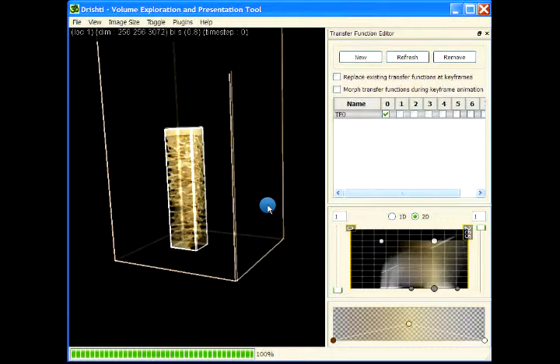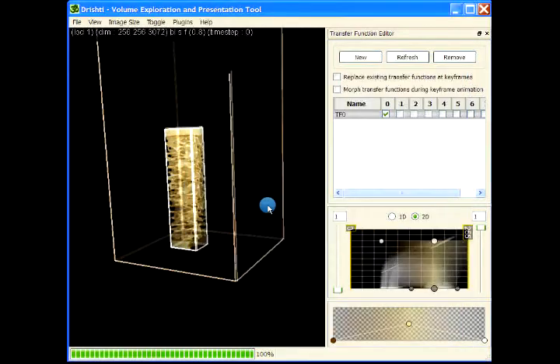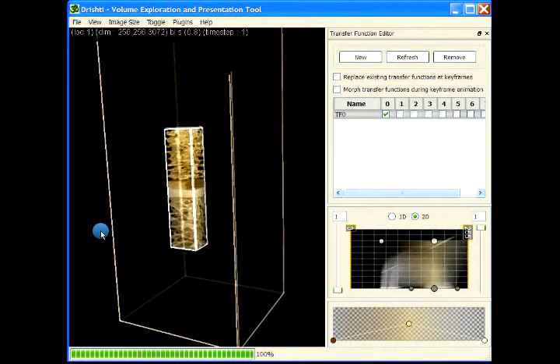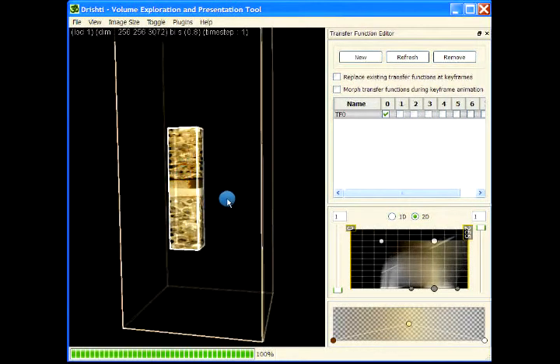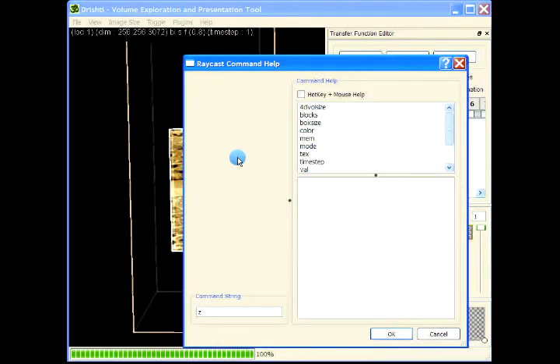And similarly you can do it for Z. So Z jump, say instead of 1 you can do say 0.5, so it will take the jump by half the box size along the Z direction. So if I press Z now, it's going half, so you can see the gap between the first and the second time step, and so on. So Z jump 1, and so on.